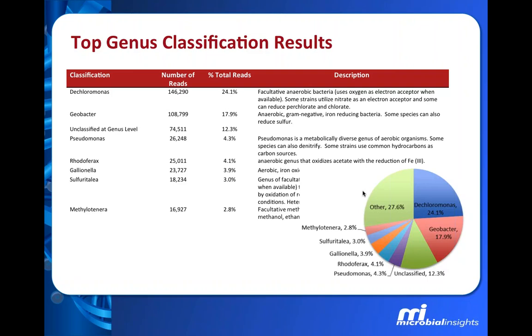For instance, with Geobacter, we're going to see that a little later in the presentation today. Actually, it's quite the opposite. Some of the things that we may be interested in, those phenotypes that we want to see, are often rare within a genus. So I just want to caution you to be really careful in your interpretation of this.